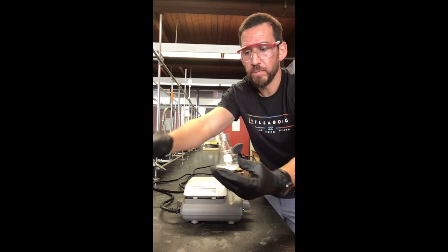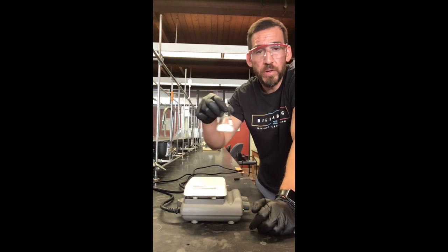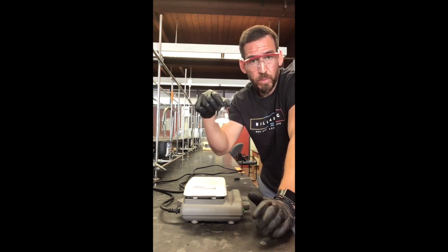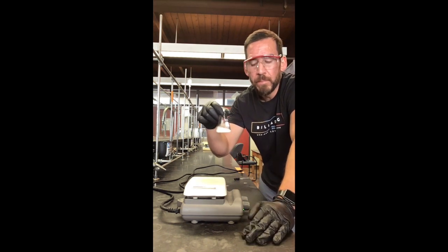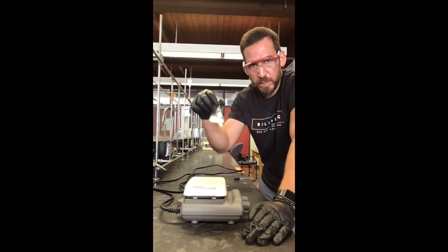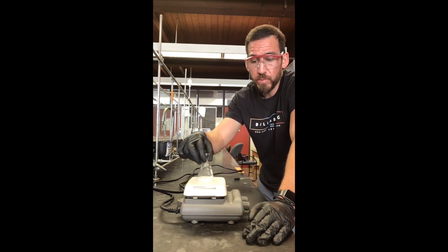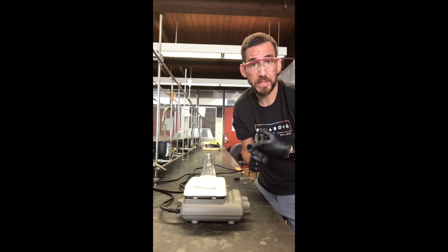If it's an unknown compound and you're trying to recrystallize it, what you want to do is just add a little bit of solvent, so it's all trial and error, right? So we're scientists, it's all trial and error. You want to add solvent to the solid material before you put it on the hot plate. The reason why you do this is because you don't want to basically burn your substance.